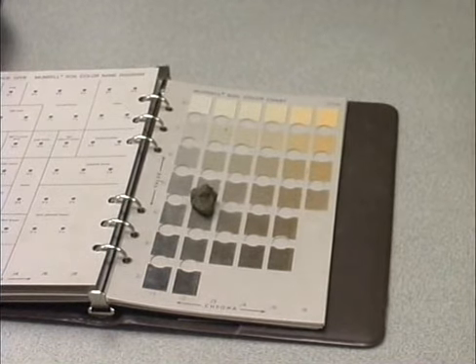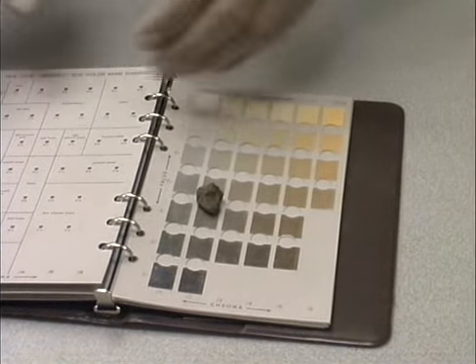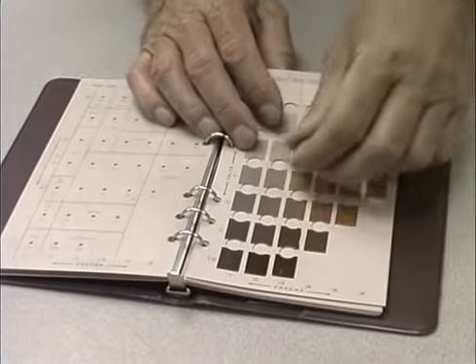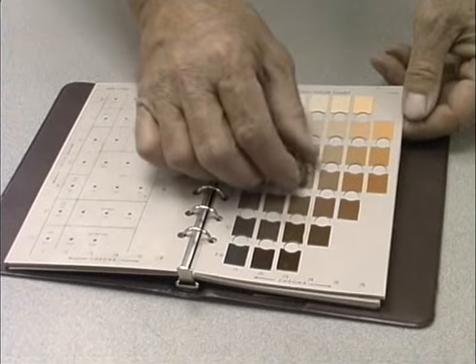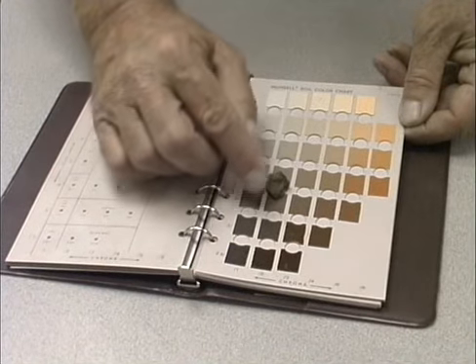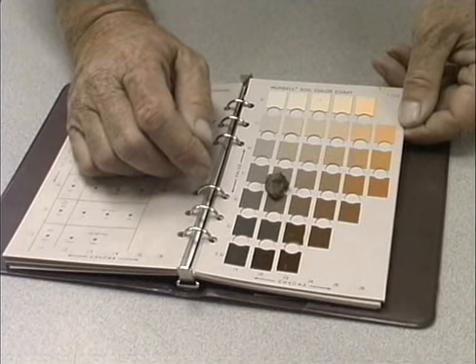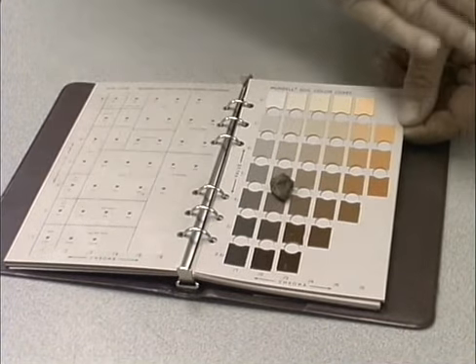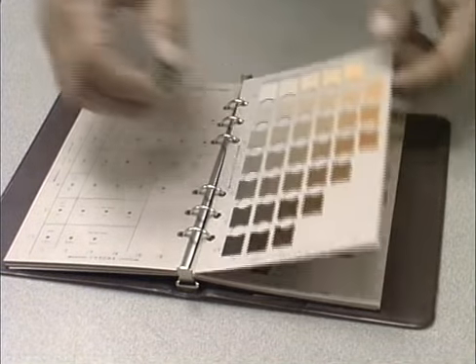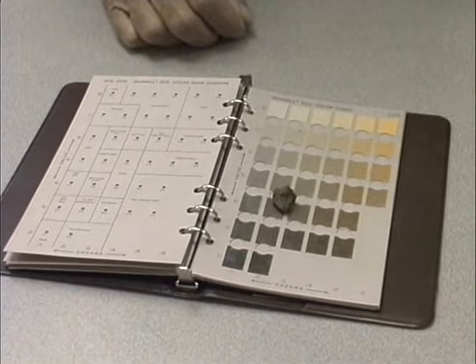Sometimes when I'm doing this and you get honed in on one particular page in the color chart, it's good from time to time to refer back to other, nearby pages, to see if we're still in the right range or not. Now, you could probably also interpret this soil as being one that fits onto this page. One of the things I find wrong with this page is that there's a little bit more lightness or yellowing in the brown here instead of graying. And this particular soil fits more over on the 10YR hue page than it does on the 7.5YR. So just as a cross check, I've done that, but we really fit better onto this page, the 10YR hue.